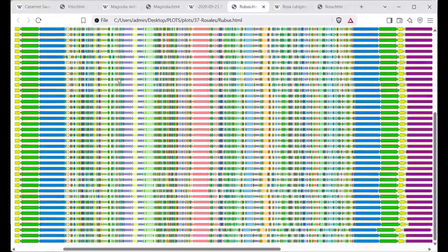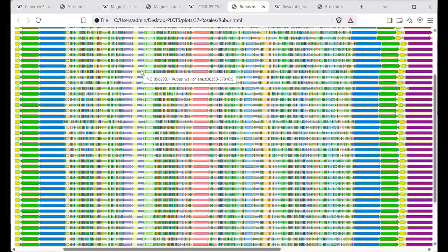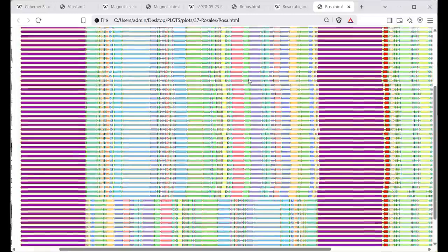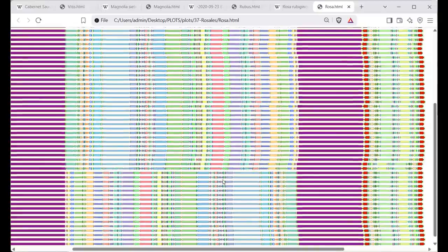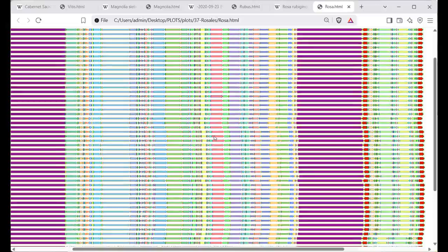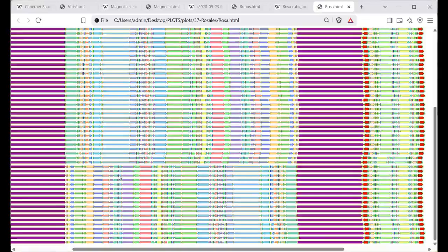So probably they had both of these sequences and picked only one of those two orientations based on uniformity among others. I'm not sure how it's done, but what I see from time to time is that in some genera, a portion of the sequences have an inverted single copy region, either the long or the short one, compared to the rest. They're not usually 50-50, they're usually like, say, 20-80 or 10% versus 90%, but I see some of them with the opposite orientation.